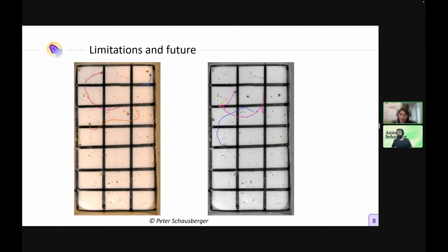So when there is a mistake, there is a mistake, and the mistake is propagating. But if you have non-crossing individuals, like the mites, for instance, they won't climb on top of each other. So if you have this kind of individuals, the number of mistakes is very low. Well, it depends on the quality of the recording, the conditions and everything. But usually the number of mistakes is quite low as long as the individuals are not walking on top of each other or swimming above each other like fish or birds, where 3D space is messy.